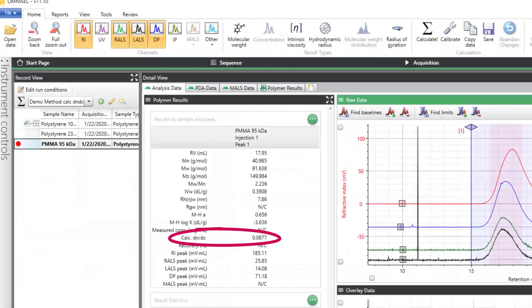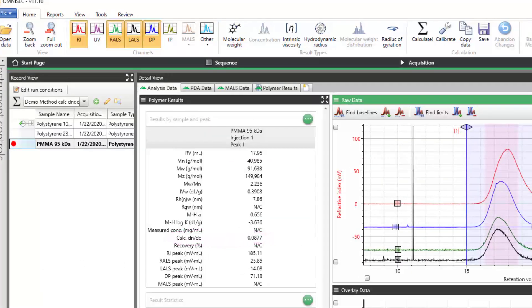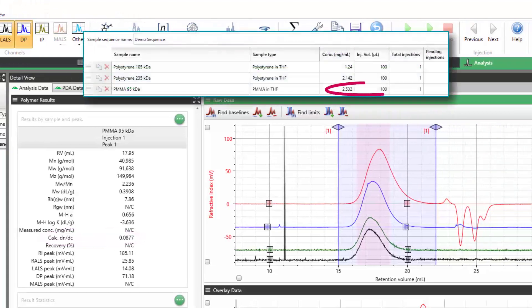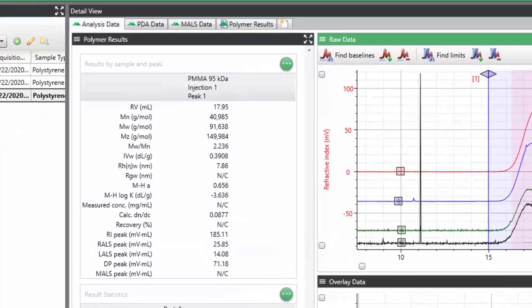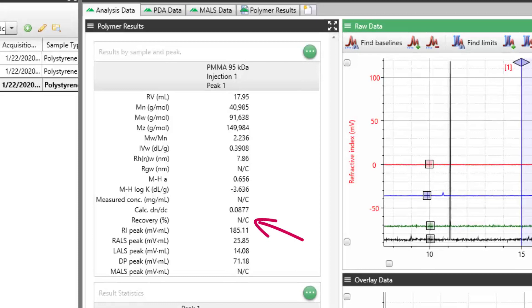When this method is applied, the DNDC value for the sample will be calculated based on the input sample concentration and injection volume, along with the observed refractive index peak area. There will be no recovery information because the software is assuming 100% quantitative recovery in order to calculate the DNDC value.